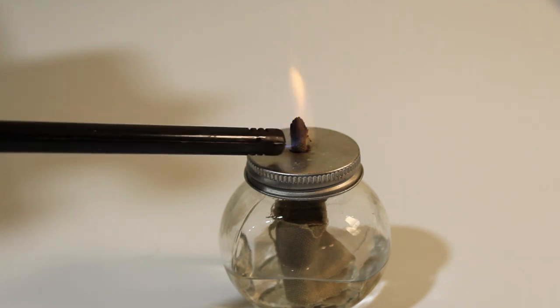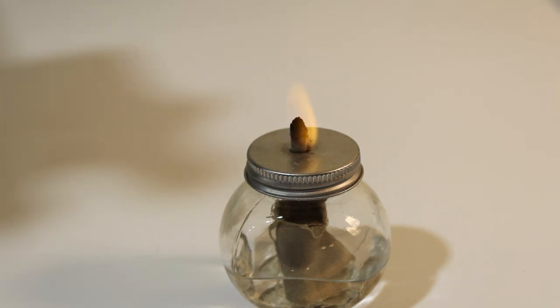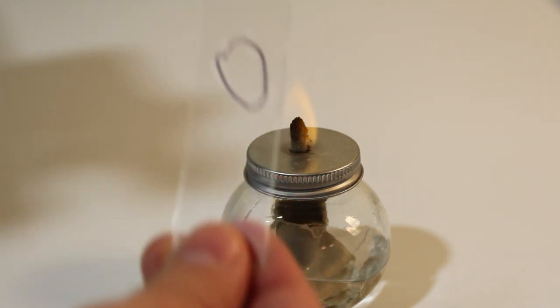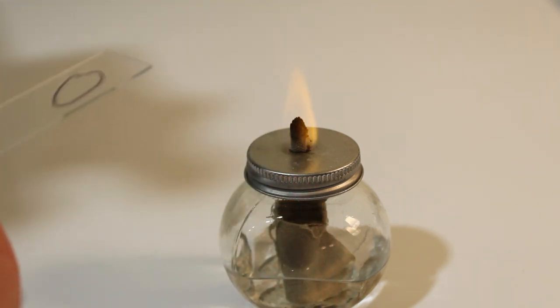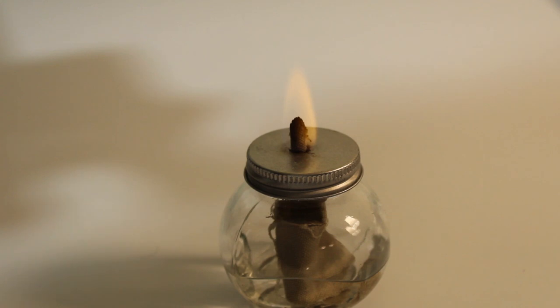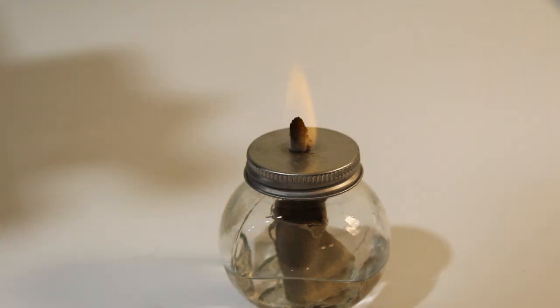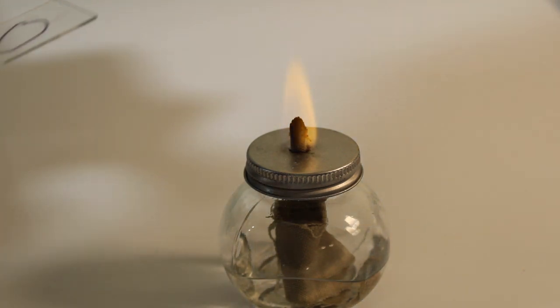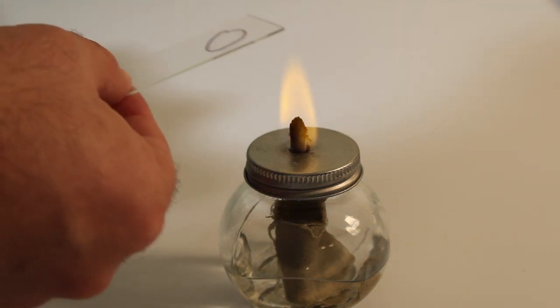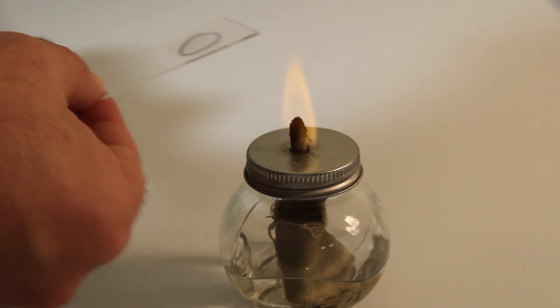So light your Bunsen burner or alcohol lamp, and then holding the slide as far away from your ring as possible, quickly pass it through the flame four to five times. When this is done, the slide should be hot to the touch, but not burning. For a Bunsen burner, you're only going to want to do this two to three times.